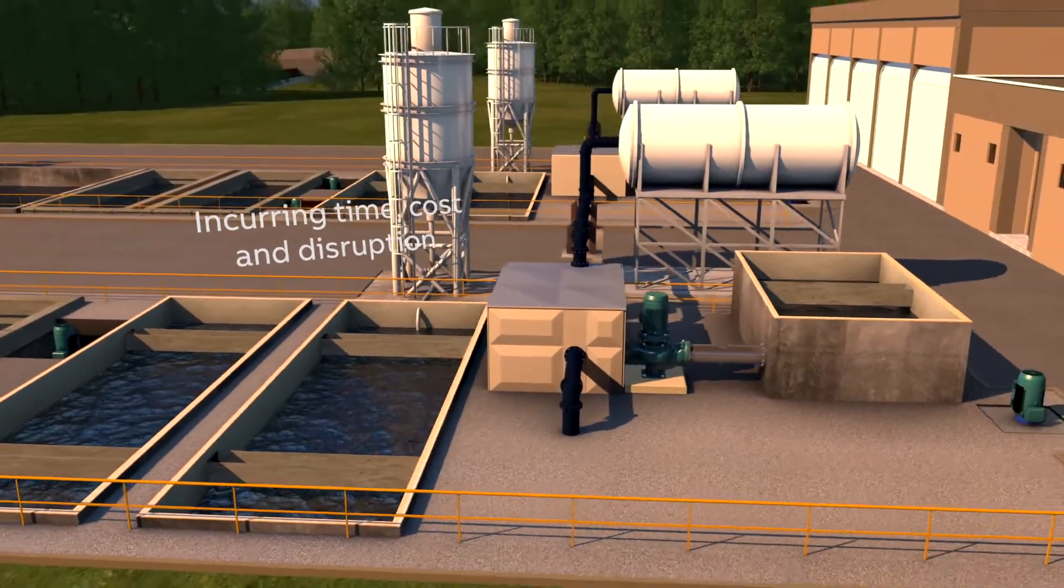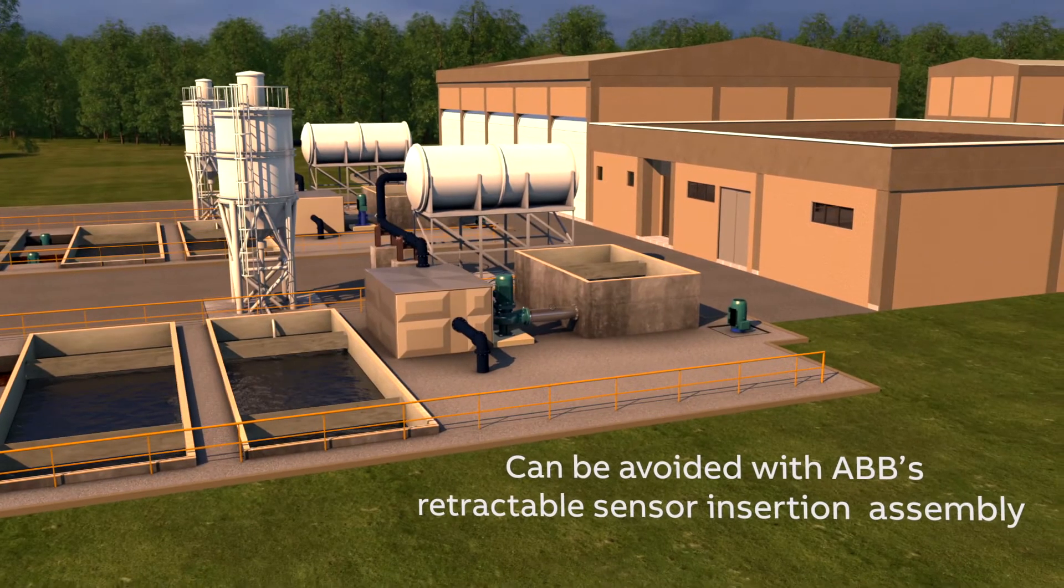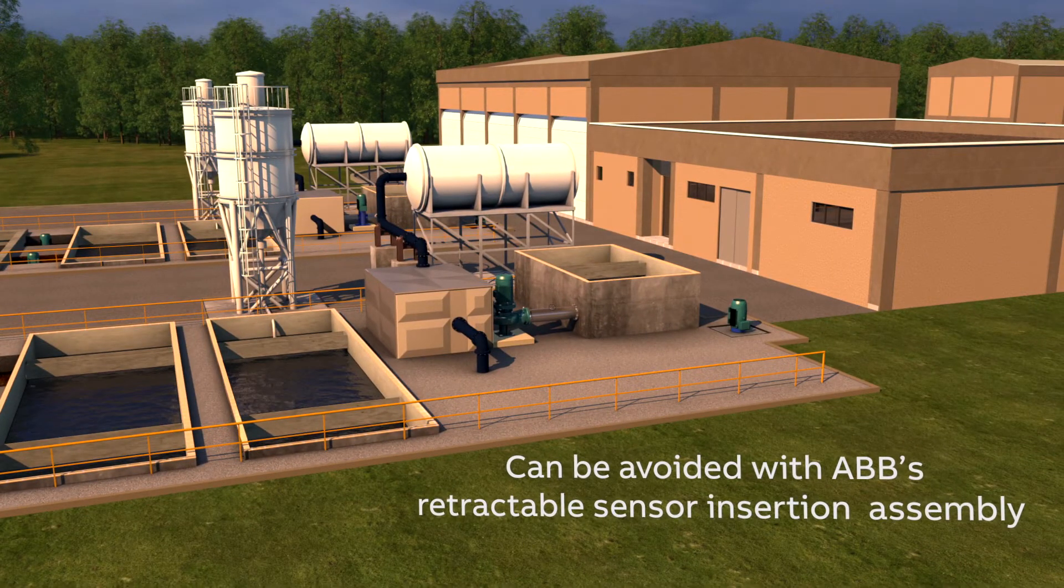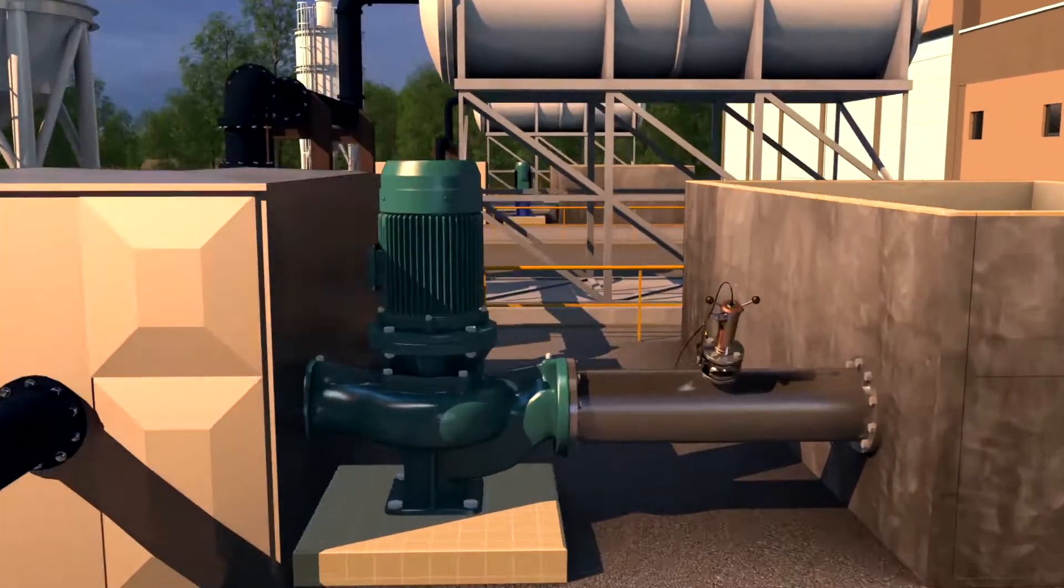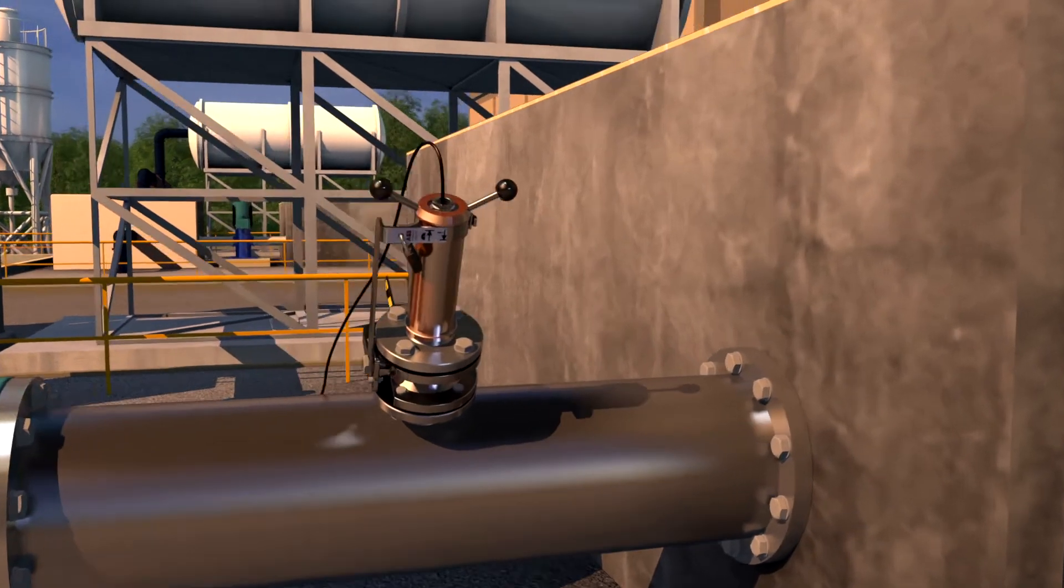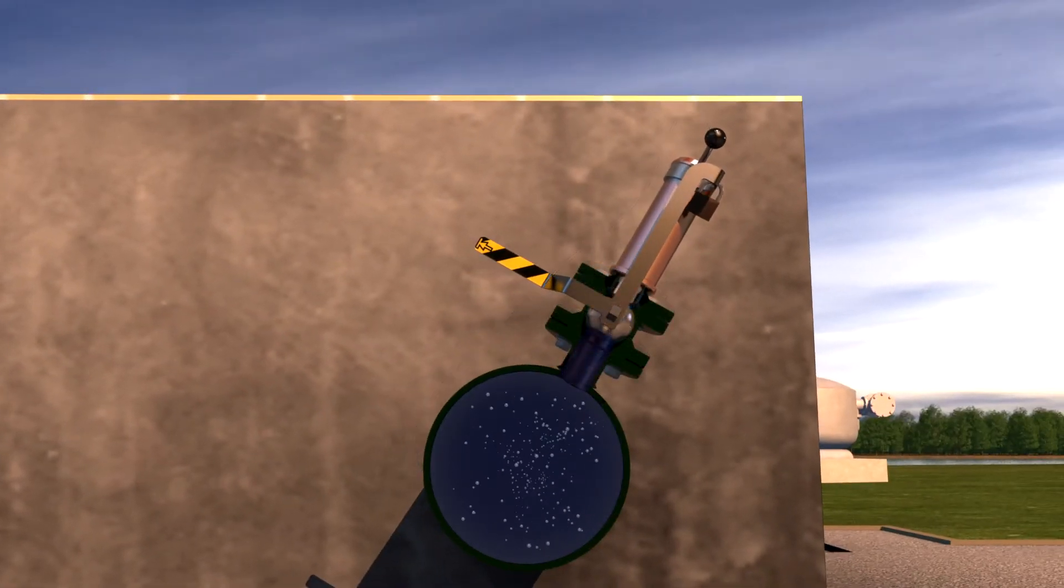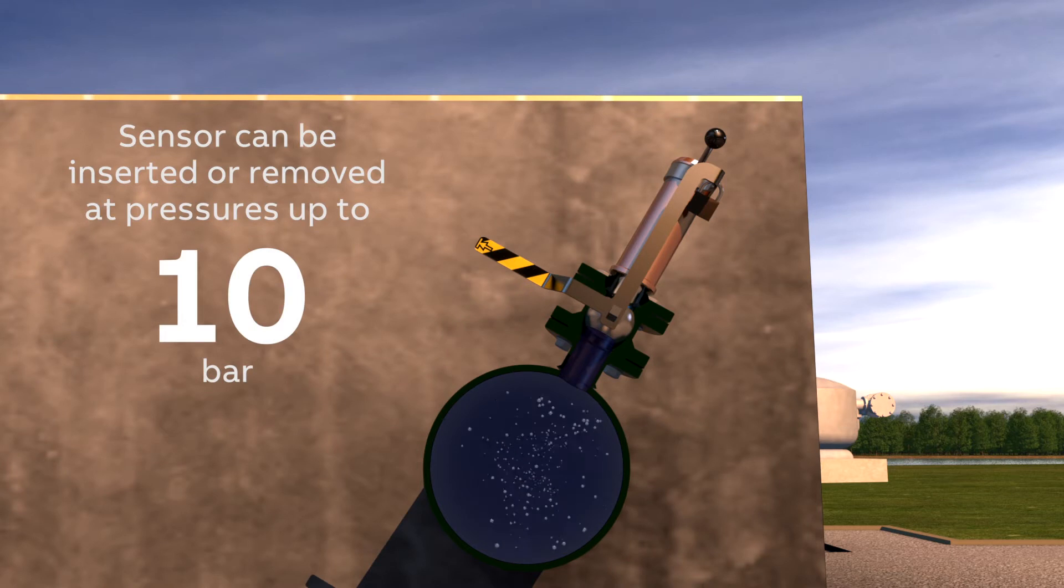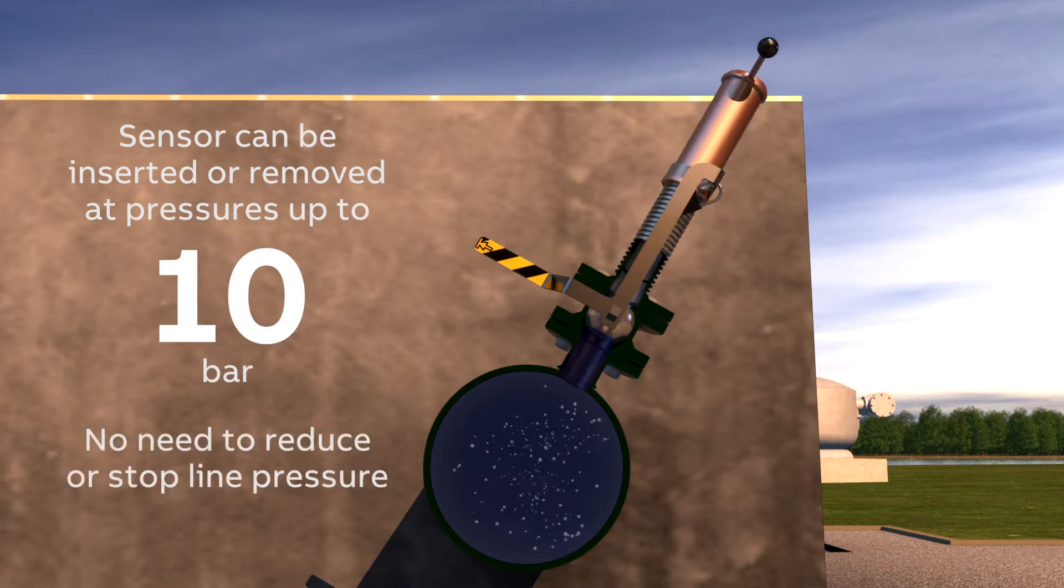This can now be avoided by using ABB's retractable sensor insertion assembly. Once bolted to the pipe flange to create a secure connection, the assembly enables the sensor to be inserted or removed at pressures up to 10 bar with no need to reduce or stop line pressure.